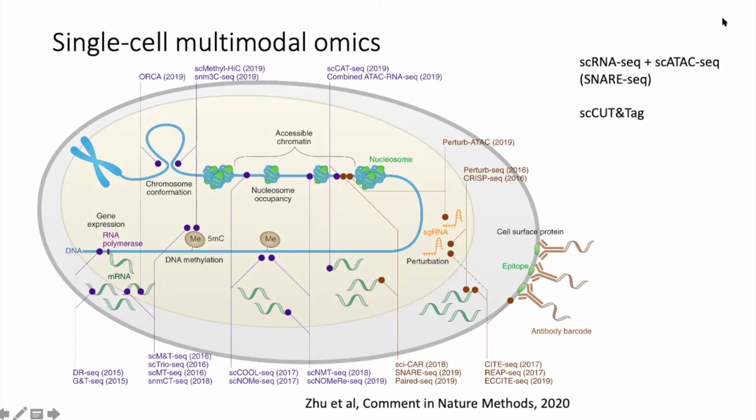So then you have an antibody to the transcription factor of interest or the histone modification of interest, and then you cut there. So then you get to know if your transcription factor is at the location, is there to regulate the gene expression. Well, that's what I want to say.